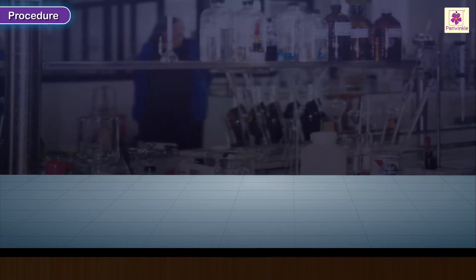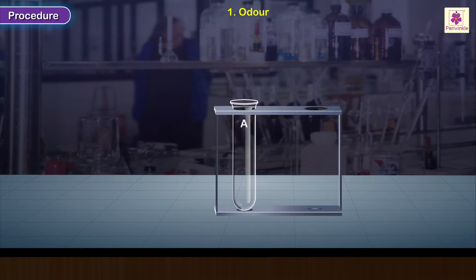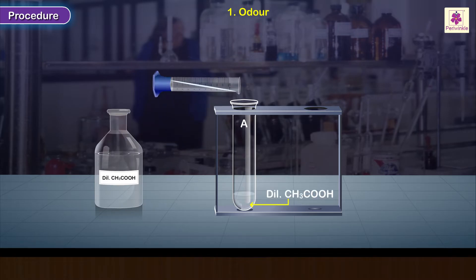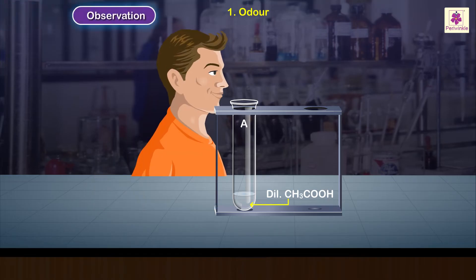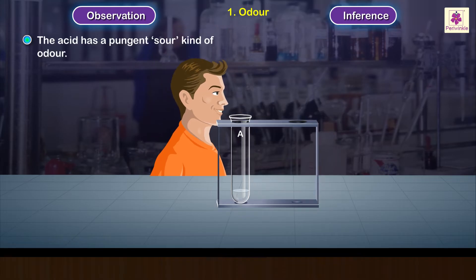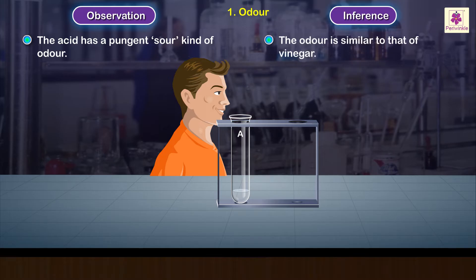Procedure 1 – Odor: Take a test tube and label it A. Take about 2 ml of dilute ethanoic acid in the test tube A and cautiously smell it. Observation and inference: the acid has a pungent, sour kind of odor. The odor is similar to that of vinegar.